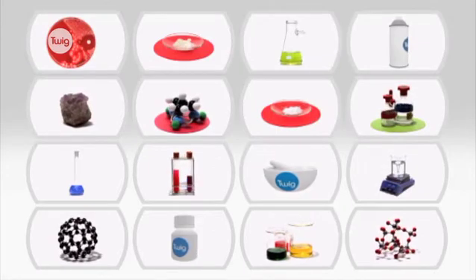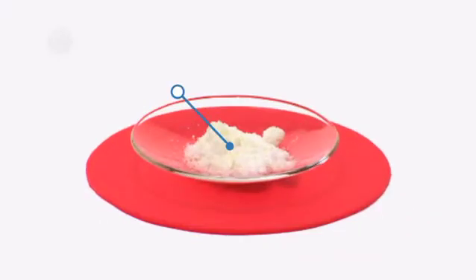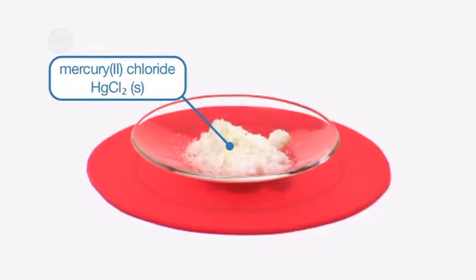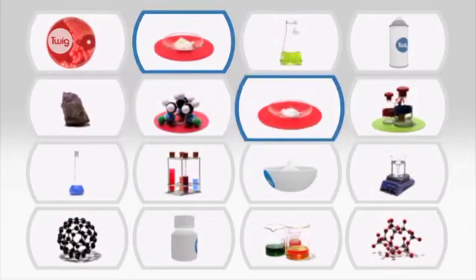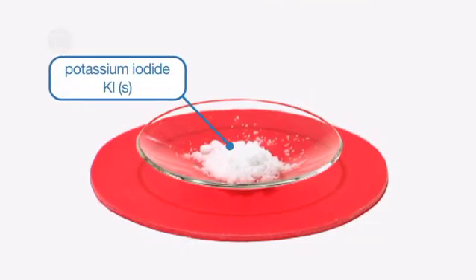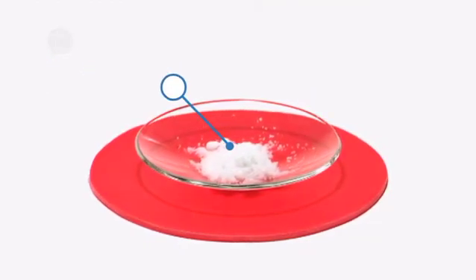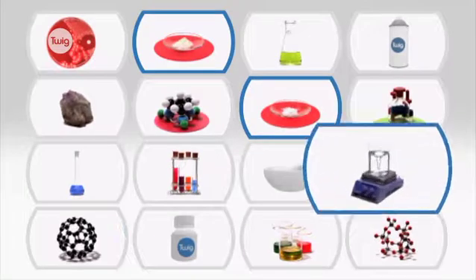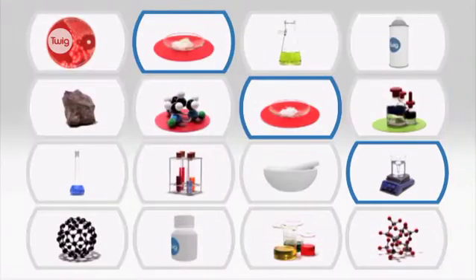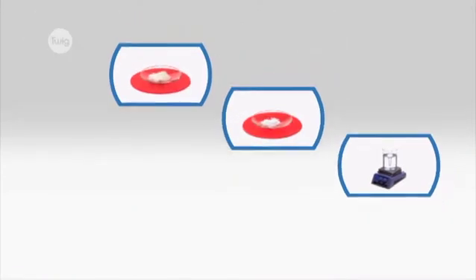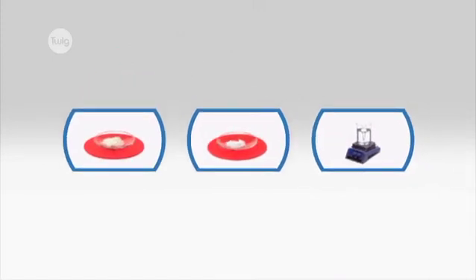To demonstrate this we need mercury chloride to make a saturated solution, potassium iodide to make another saturated solution, and a magnetic bar and stirrer. Now let's see how mercury chloride and potassium iodide solutions react to form an insoluble precipitate.